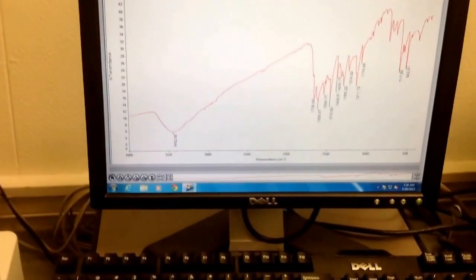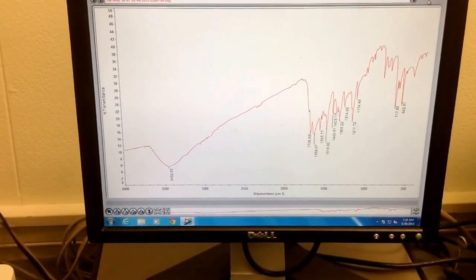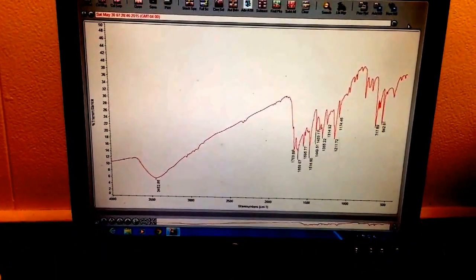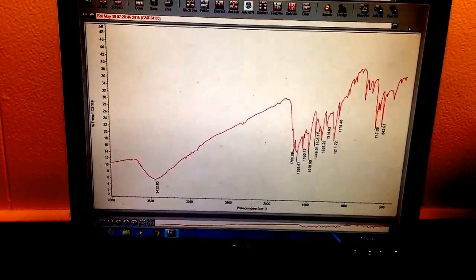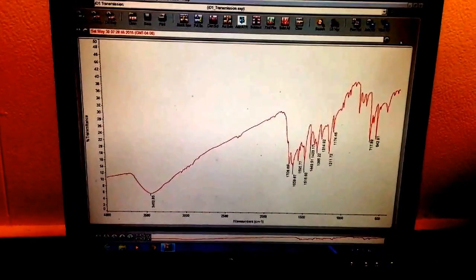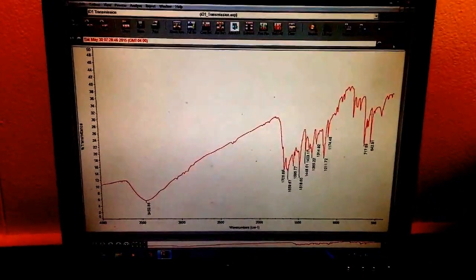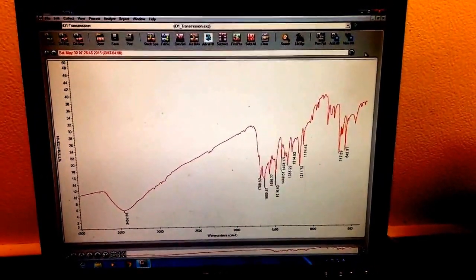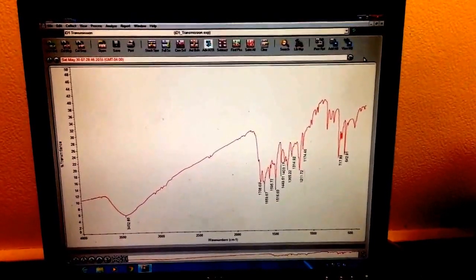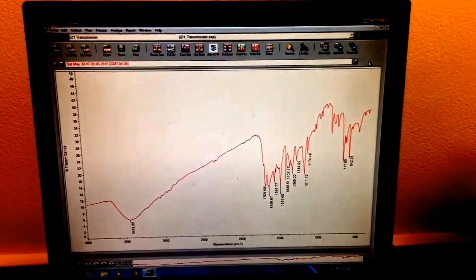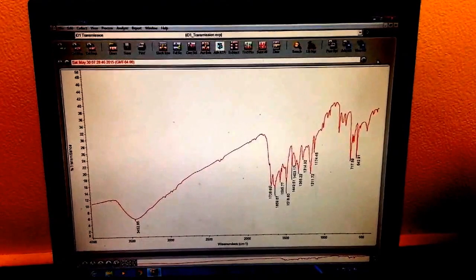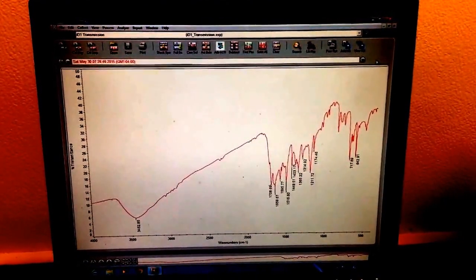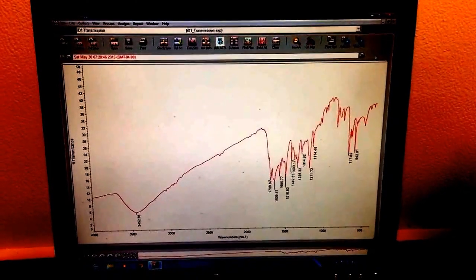We can see there some of the peaks. Interestingly enough, there is a 3400 peak that's sort of broad. There are some, it looks like there's some SP2 carbons and some SP3 in this spectrum. I really wouldn't expect any SP3, but I'll look at this a little more carefully, but you can see how we collect an IR spectrum.